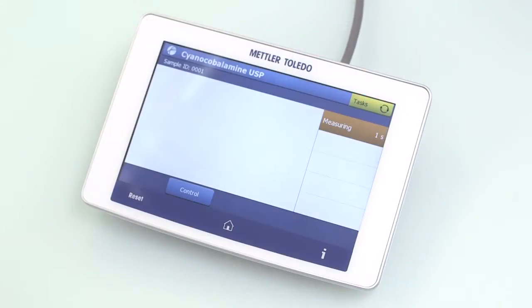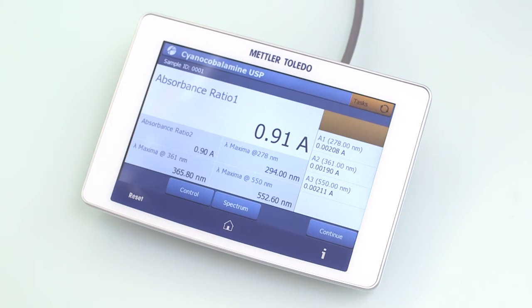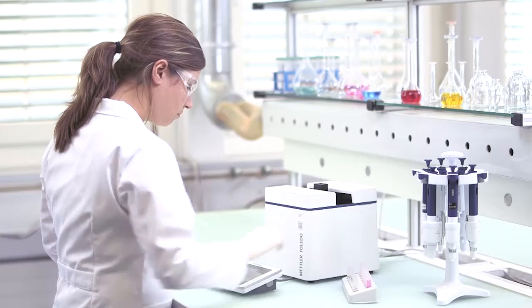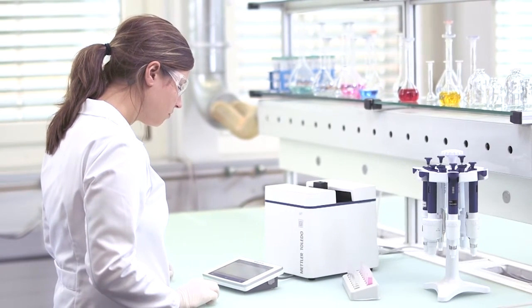The results are displayed at the instrument's terminal. No need to write down results as they are all sent automatically to LabX. This eliminates transcription errors and ensures data integrity from start to finish.